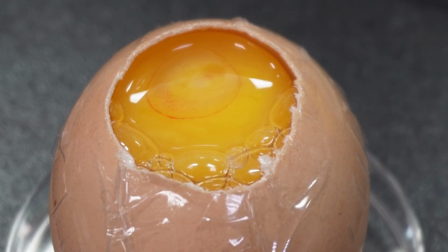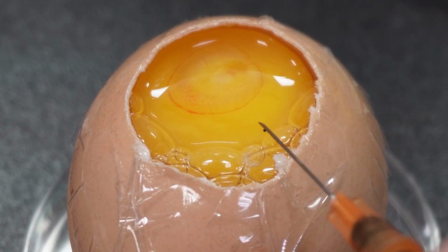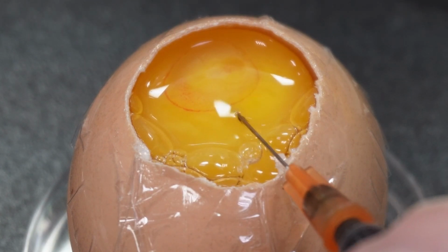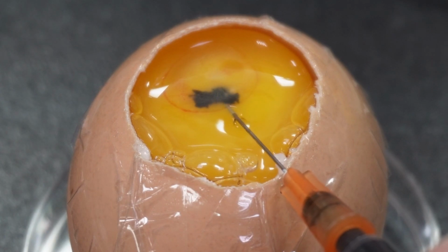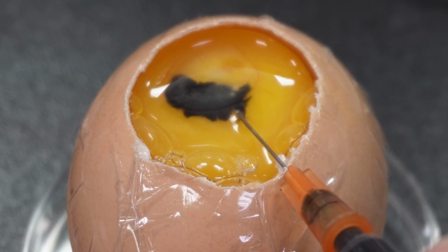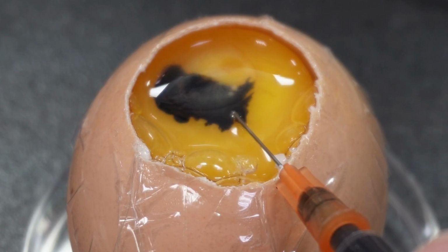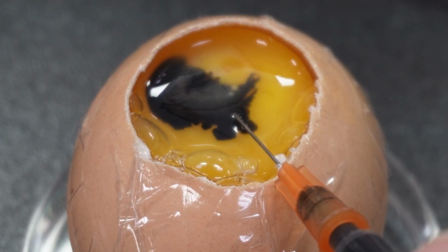This is a neat little trick. It's about adding contrast. You inject a diluted ink solution, ink like writing ink, specifically Sumi ink, mixed with Ringer solution, which is a saline solution. You inject it underneath the embryo, between the membrane it sits on and the yolk itself. Oh, I see. So you create a dark background behind it. Exactly. That dark ink layer makes the translucent white embryo pop. Suddenly it's much easier to see, to handle, to figure out its orientation.